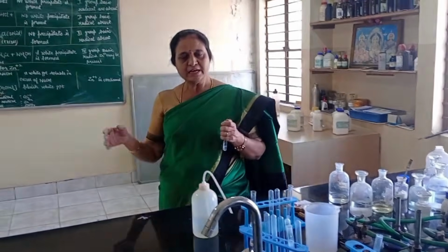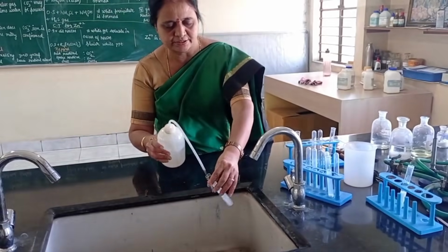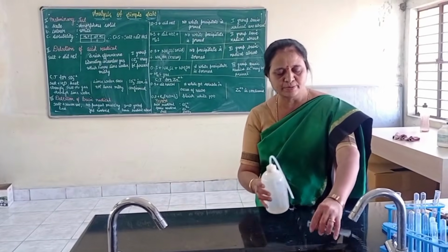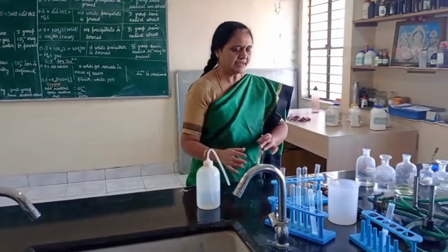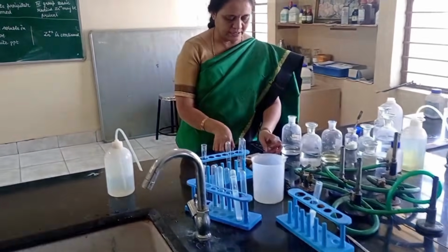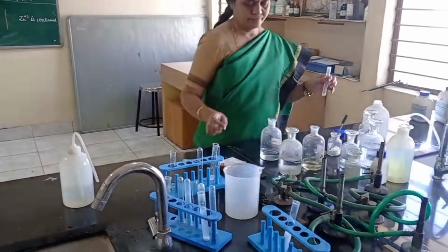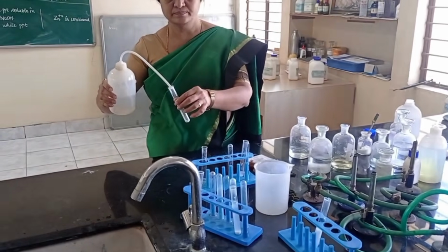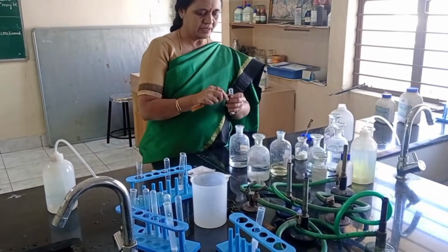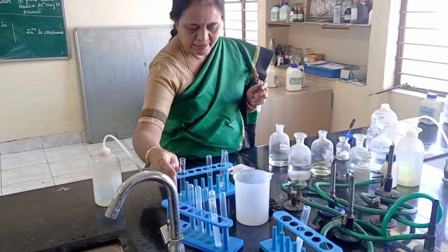And we can check another confirmative test for carbonate. So I am doing CT for carbonate. See, what is the CT for carbonate? I am taking a little salt. Salt plus water. Then I will boil. Salt plus water, boil, and we take lime water.